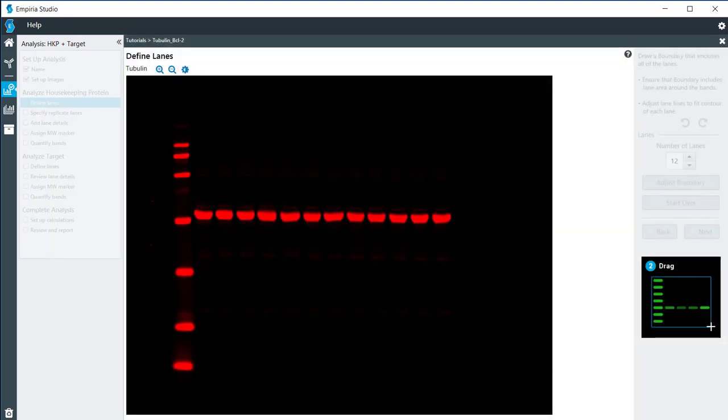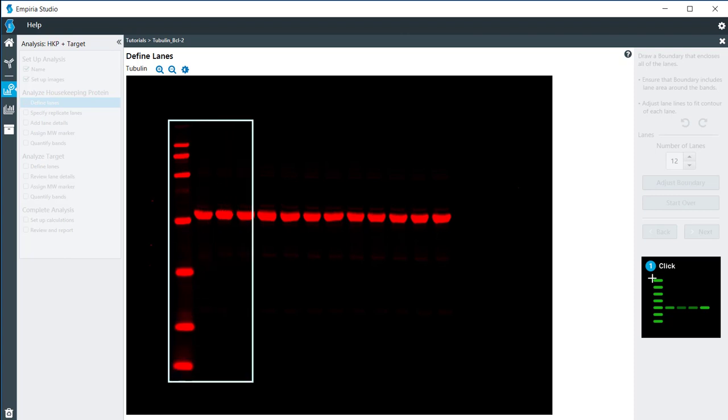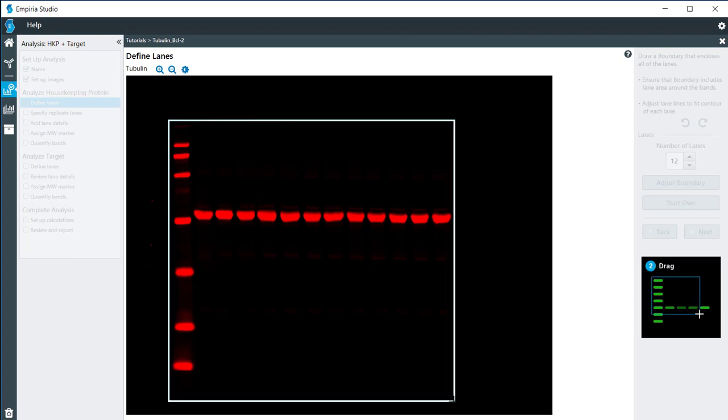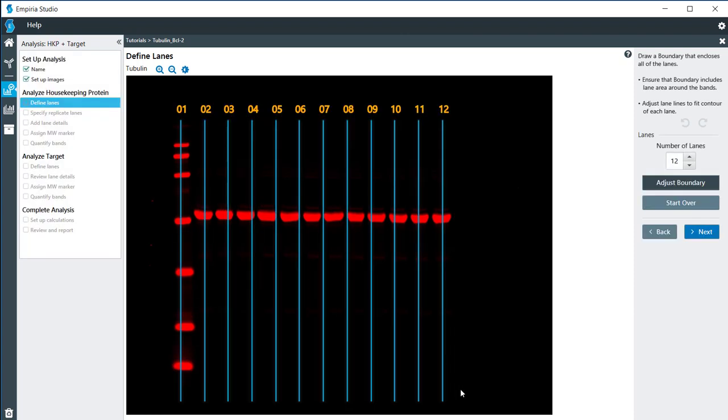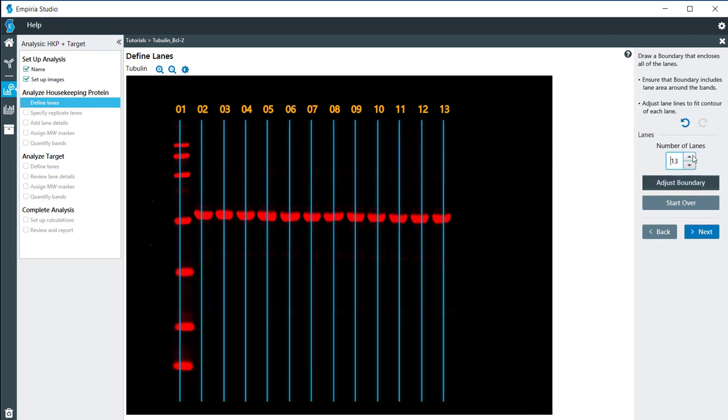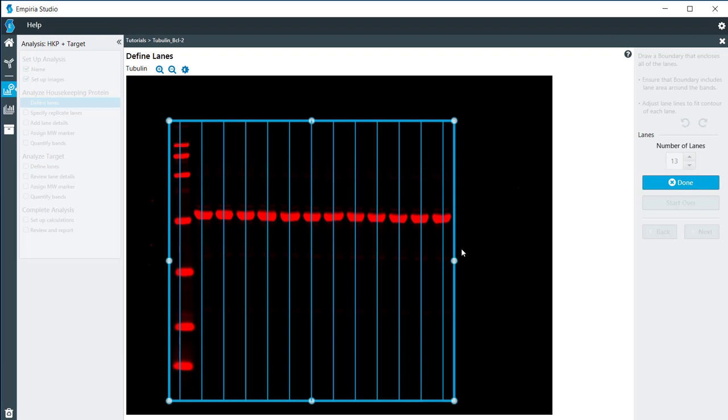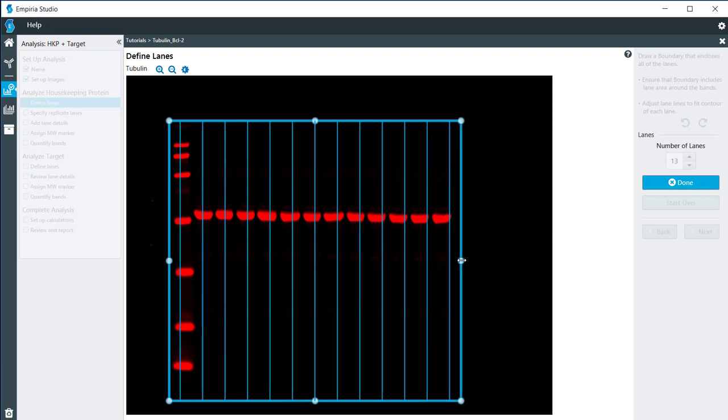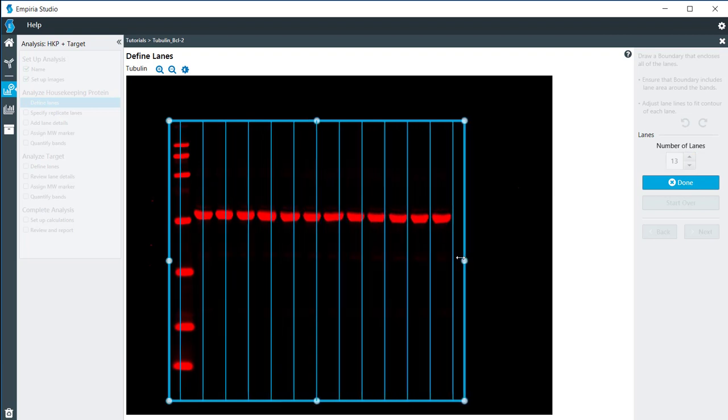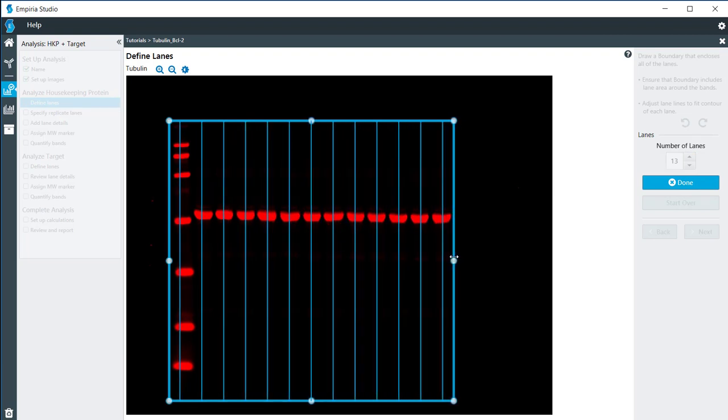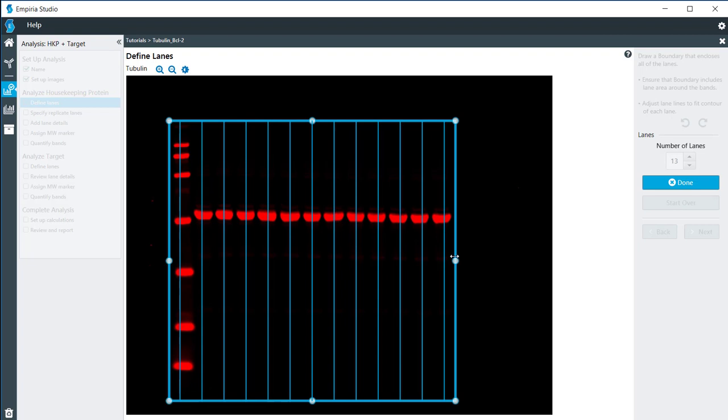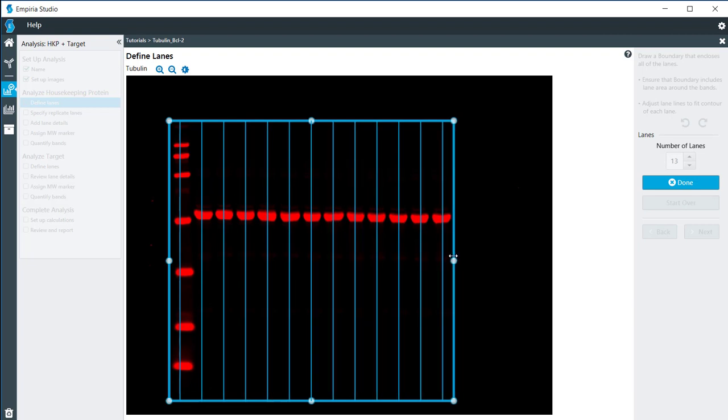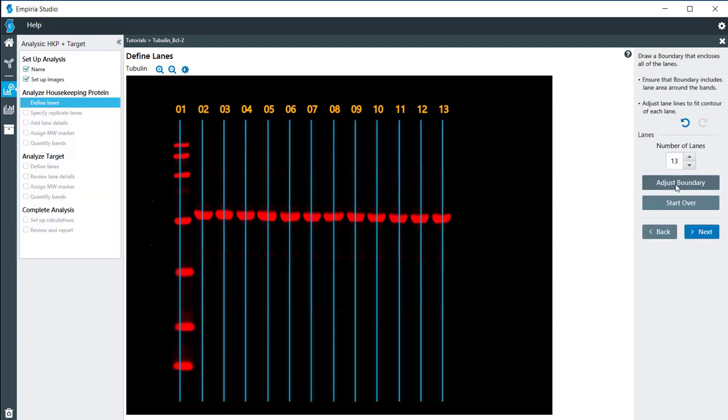I'm going to define my lanes right here, just by clicking and dragging. I have 13 lanes on here. If need be, I can adjust the boundary to make sure that those lane lines are going somewhat through the center of the lanes. Click done, and then next.